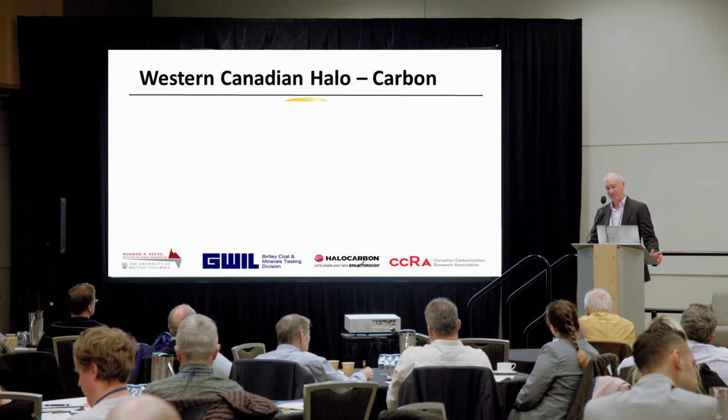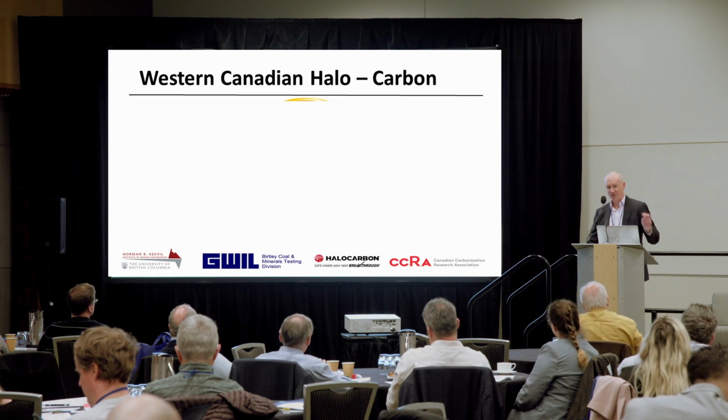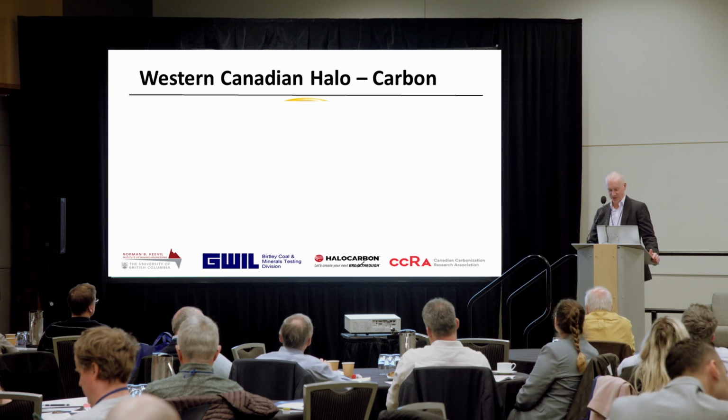So in general, everything that we've seen using this halocarbon fluid for float sink tests is looking really, really good, really encouraging. So now I'm going to go off on a tangent briefly and talk about what I'm going to call the Western Canadian halocarbon product. I'm going to say the one that you are all much more familiar with.